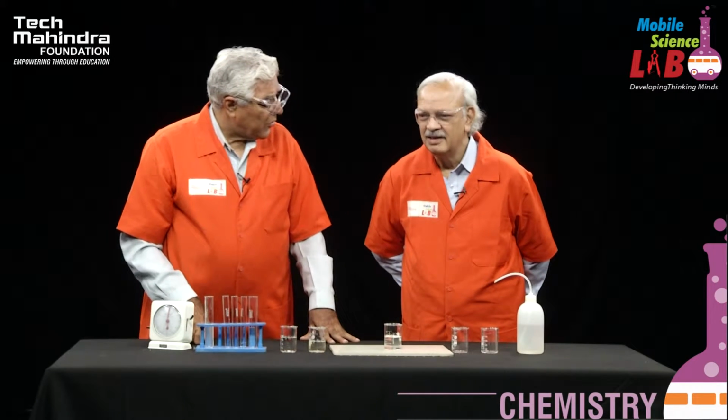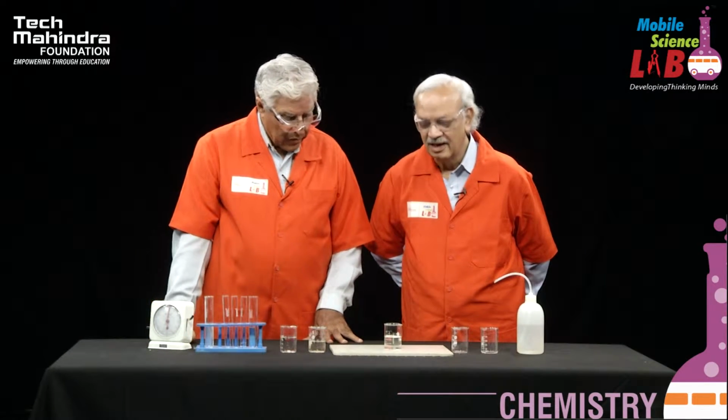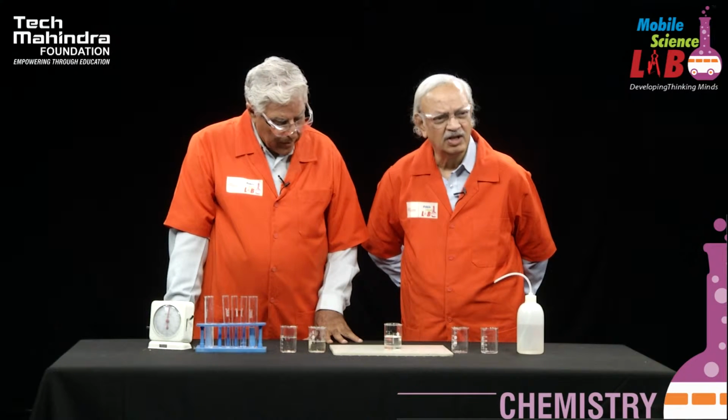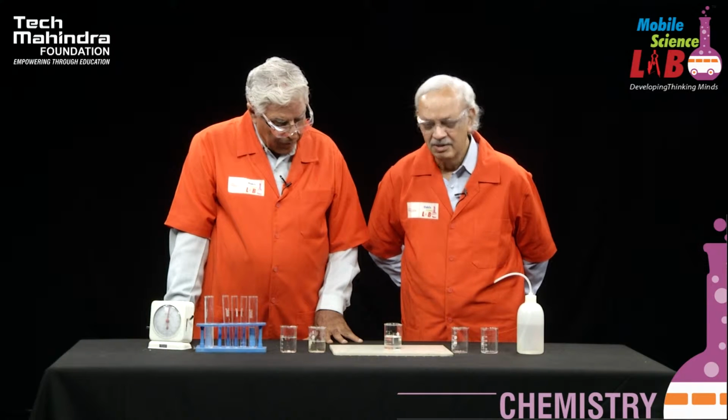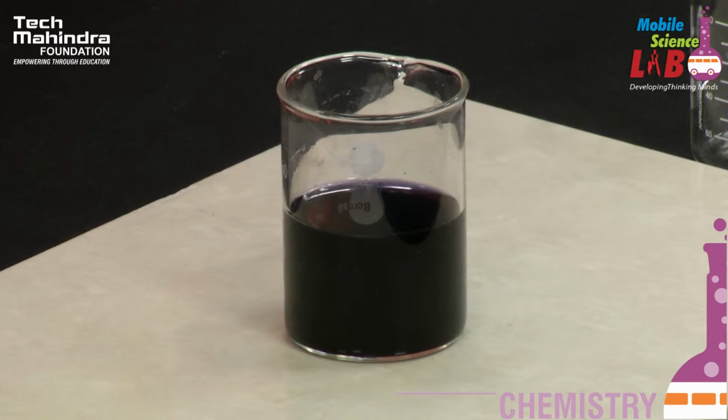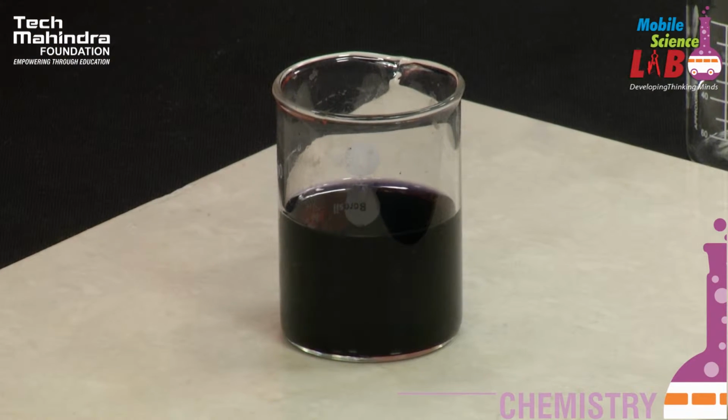Now that looks like magic. Why do we get this bluish color after 60 seconds or lapse of time? If solution concentrations are more, you get a lesser time, the reaction is faster. There it is again. Blue color has come again. So you see students, the beauty of this one reaction, we are making the color disappear, come back again, disappear, come back again.